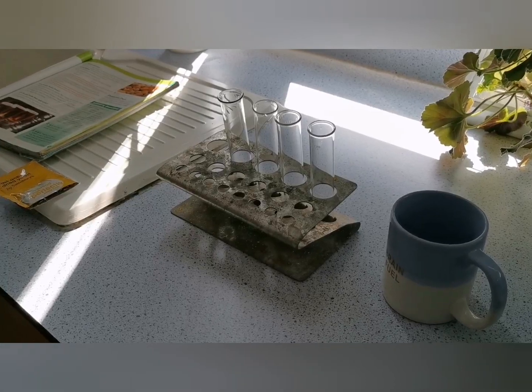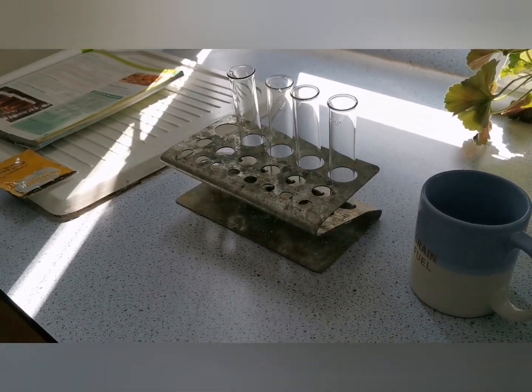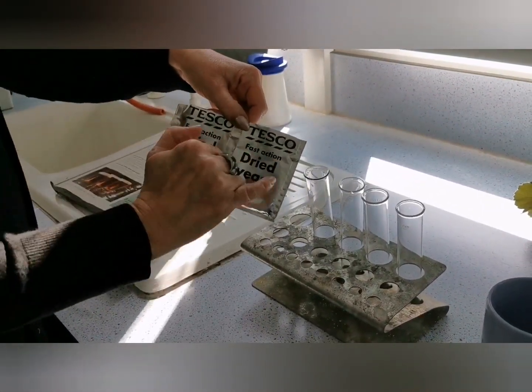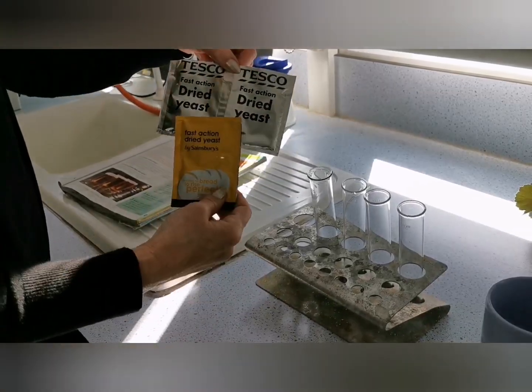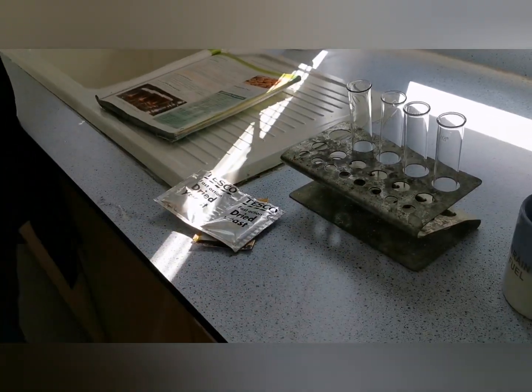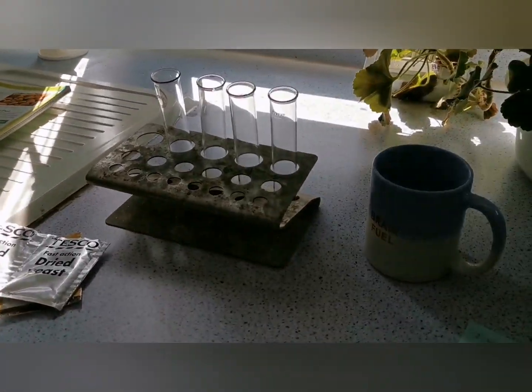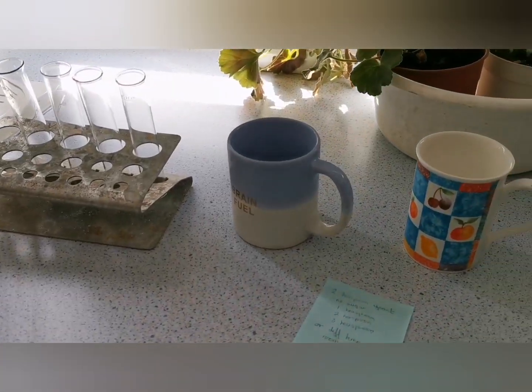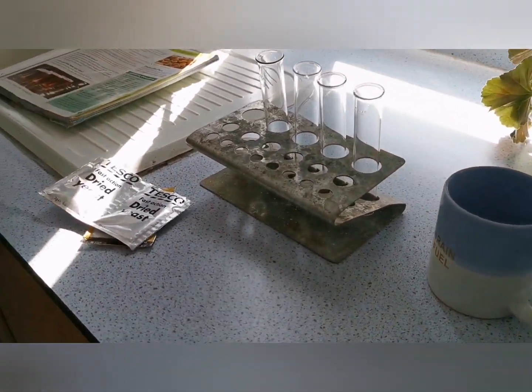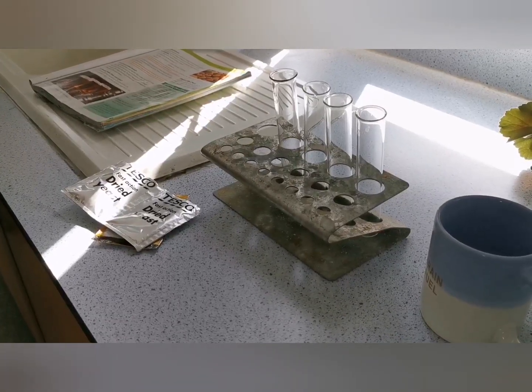Okay, so here we are today looking at anaerobic respiration, and we are going to look at the anaerobic respiration of yeast. So here we have some what they call fast action dried yeast from Tesco's or Sainsbury's or any other well-known brand. So yeast is a microorganism. It's used in many things to make food, beer, wine, and what we're looking at is how yeast does anaerobic respiration, so that means without oxygen, and it produces ethanol and carbon dioxide.